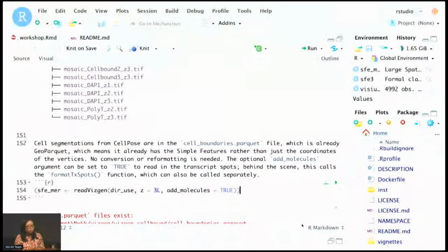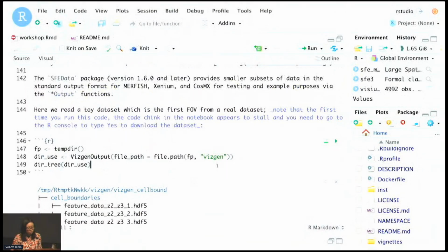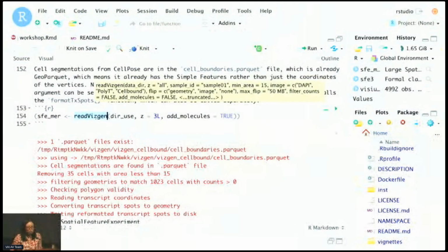Excellent. So first question: as you've pointed out, these technologies are quite new, and output structures, as you show here in this tree, as well as formats, change frequently. How do you deal with that for your functions? I think it depends on the technology. For Visium, it's pretty stable. But for VisGen, there are different versions, so internally the read VisGen function will try to determine which version it is and deal with the different scenarios. Okay, so how often do you end up updating your functions? I'll also update the function.